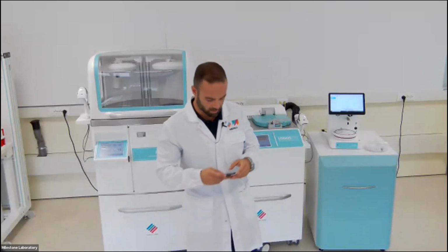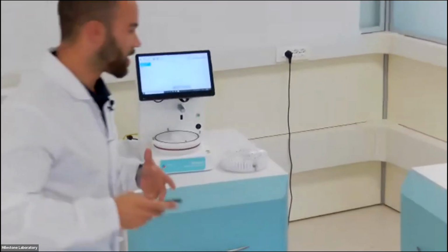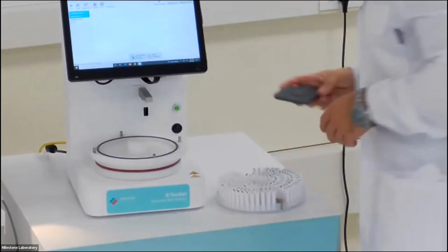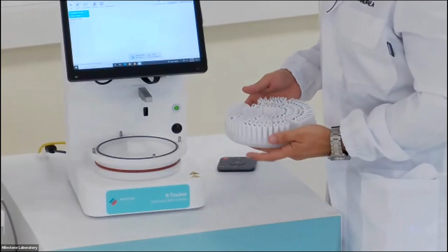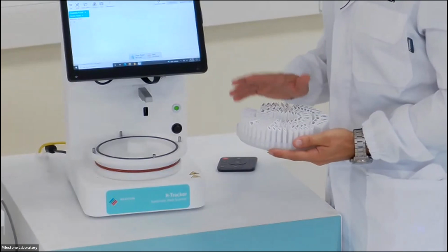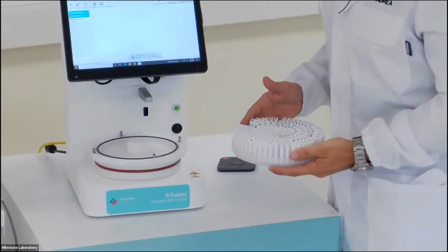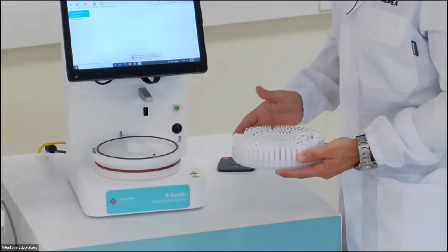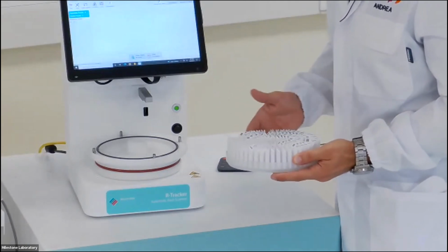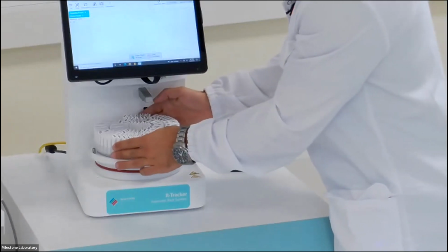Okay. Thank you for the questions. And these give me the possibility to show you what happens when an error occurs. So first of all, if the cassettes are covered with formol, it's just good practice to wipe them with a towel, just a short wipe, and load them on the R tracker.